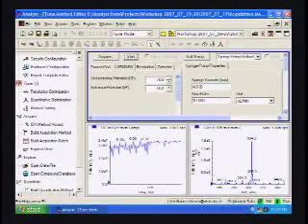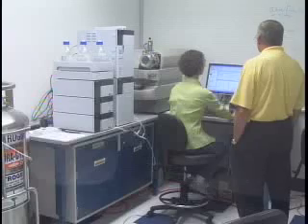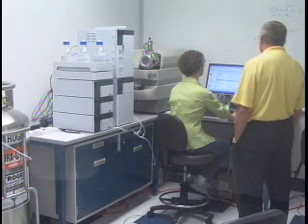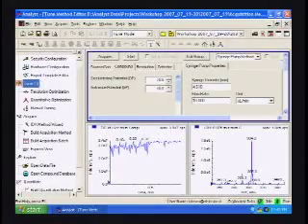So we'll stop this function here, and we'll go back to the quantitative optimization screen. One other note there. The total counts for the signal there can give you a clue of whether or not you have to do another dilution. I believe it has to be in the 10 to the 6 range. I'm not sure. But if you're doing 150 samples, this would be a good point to learn what the signal needs to be before you get into the compound optimization function.